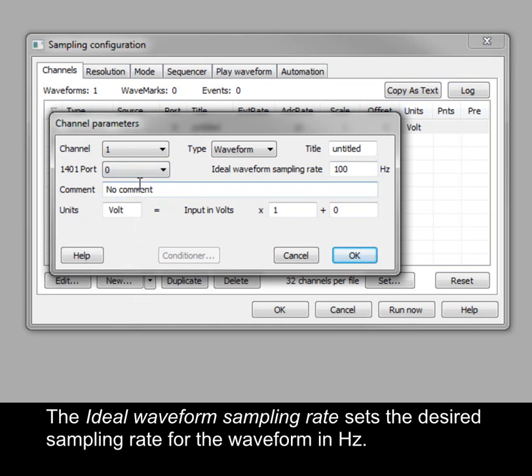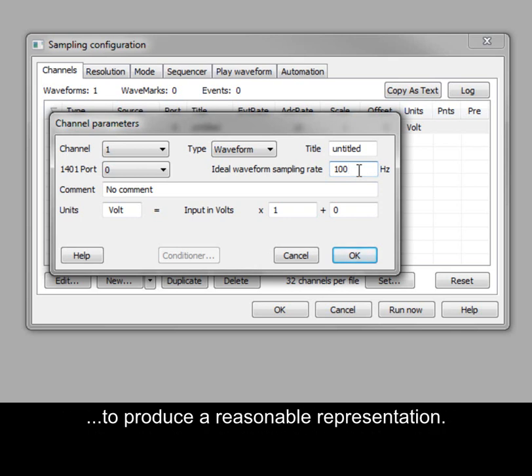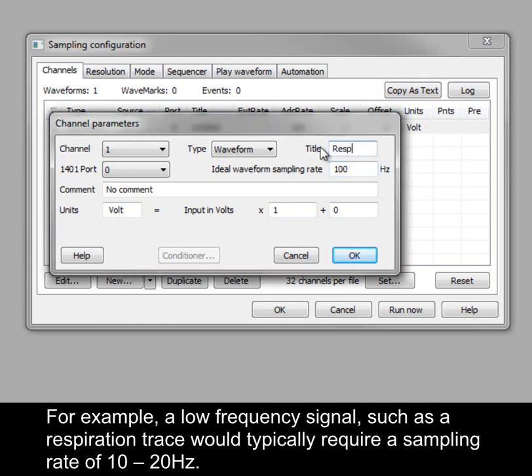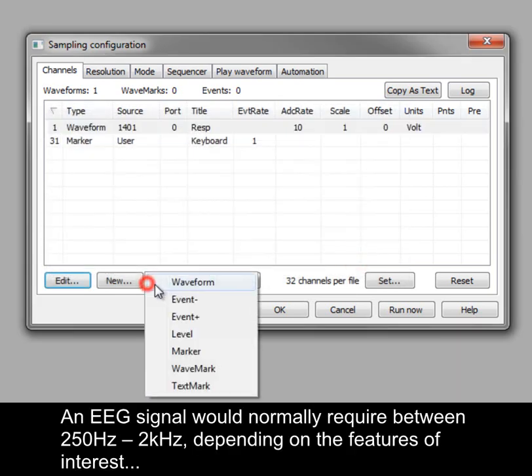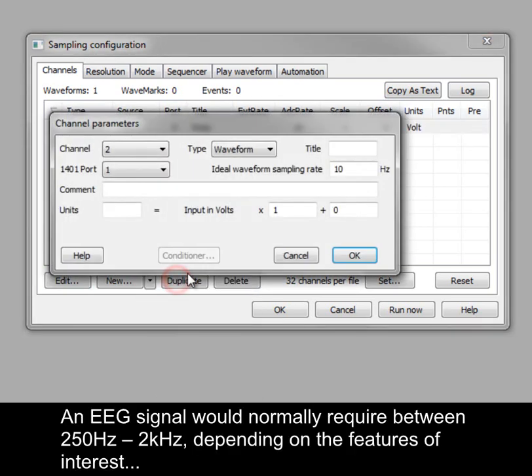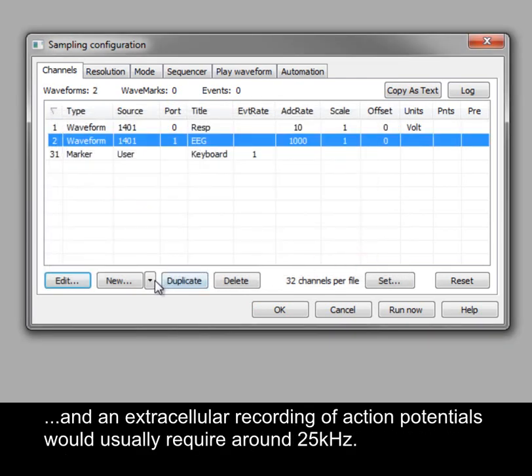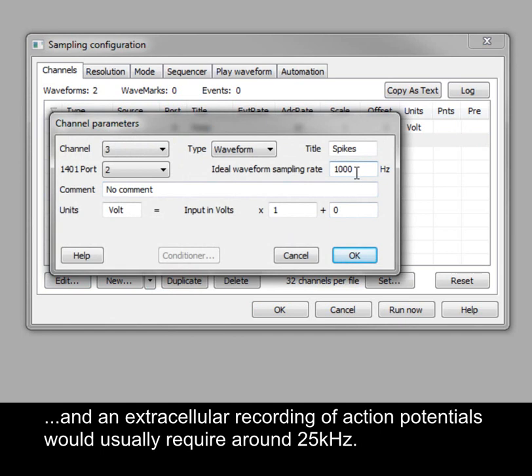The ideal waveform sampling rate sets the desired sampling rate for the waveform in hertz. As a general rule, this should be set to two and a half times the maximum frequency present in the signal to produce a reasonable representation. For example, a low frequency signal, such as a respiration trace, would typically require a sampling rate of 10 to 20 hertz. An EEG signal would normally require between 250 hertz to 2 kilohertz, depending on the features of interest. And an extracellular recording of action potentials would usually require around 25 kilohertz.